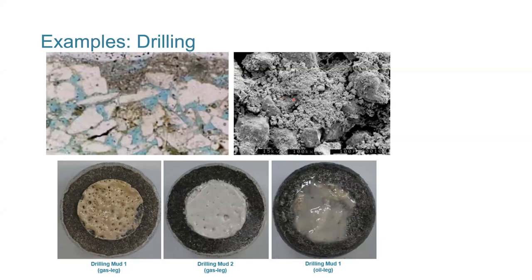In the right-hand image here, this is the same sample. Imagine we're now sitting in the well, looking back towards the formation. What you can see here is an electron microscope image, individual grains here, and the black areas are the pore space. But what we've got, these scattered areas of small crystal grains, looks like sugar on a donut. These are actually drilling mud constituents, of solids and polymer from the drilling mud, bridging particles, weighting particles, and some polymer that are sitting on the wellbore of the reservoir. Some of the pores have opened up during production, but then there's huge areas where the pores are blocked or become micropores. So this is drilling damage that hasn't cleaned up during production.